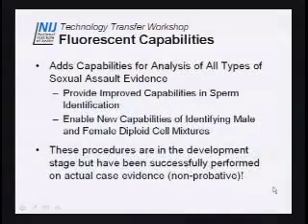Or if you have a bite mark swab, you can't go in there and tease out the male cells. You can look at the mixture profile and say, okay, these match the suspect or the male. If you have too many female cells in that mixture, as Christine was showing in preferential lysis, about a 1 to 20 mixture is about it. Once you go below a 1 to 20 mixture of male to female cells, or 2 different donors, you really start losing one of them. 1 to 20 means about 95% of the DNA profile comes from one person. 5% is what's left over.